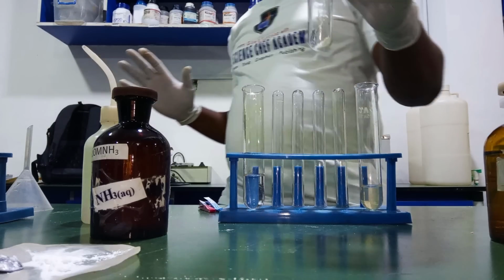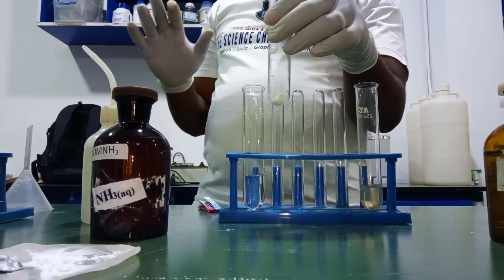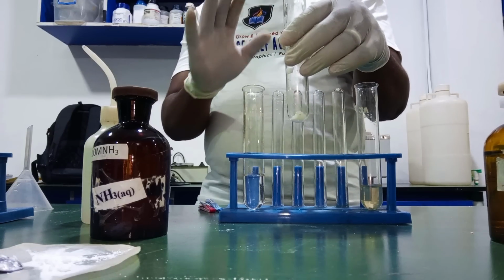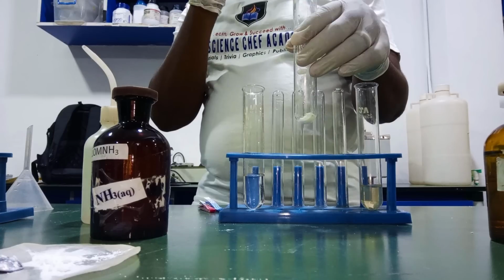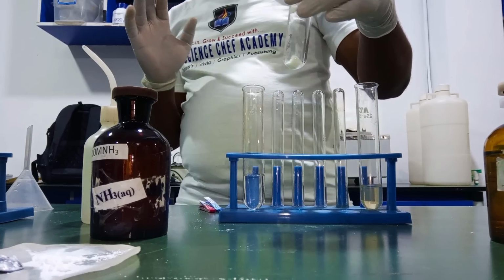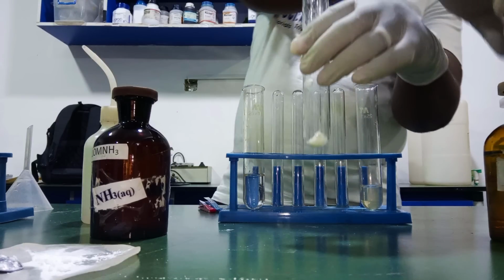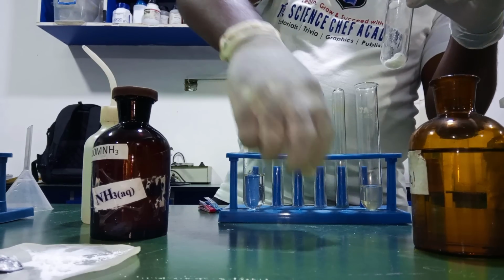But we can't use dilute HCl nor dilute H2SO4 because they will form what? Precipitates with the lead(II) ion. They will form the lead(II) chloride and lead(II) sulfate precipitates. But it is only the dilute HNO3 that will give us a colorless solution.